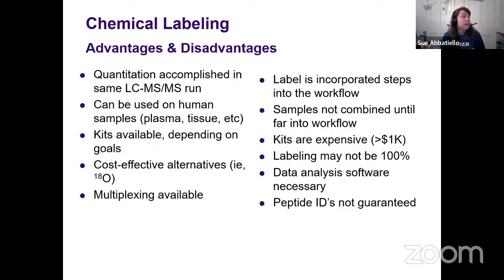I think those are the most commonly used ones. And then they'll collect different fractions along the chromatographic timeline, and each of those fractions will then be analyzed by acidic C18 reverse phase LCMS. The idea there is you're taking a portion of your whole sample, separating it from the rest, and then analyzing it individually over a reverse phase gradient.